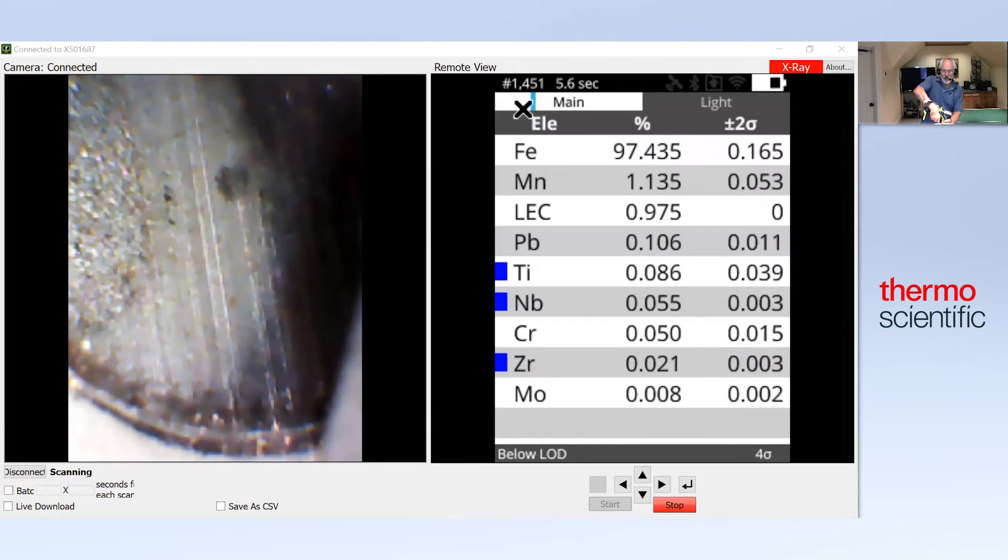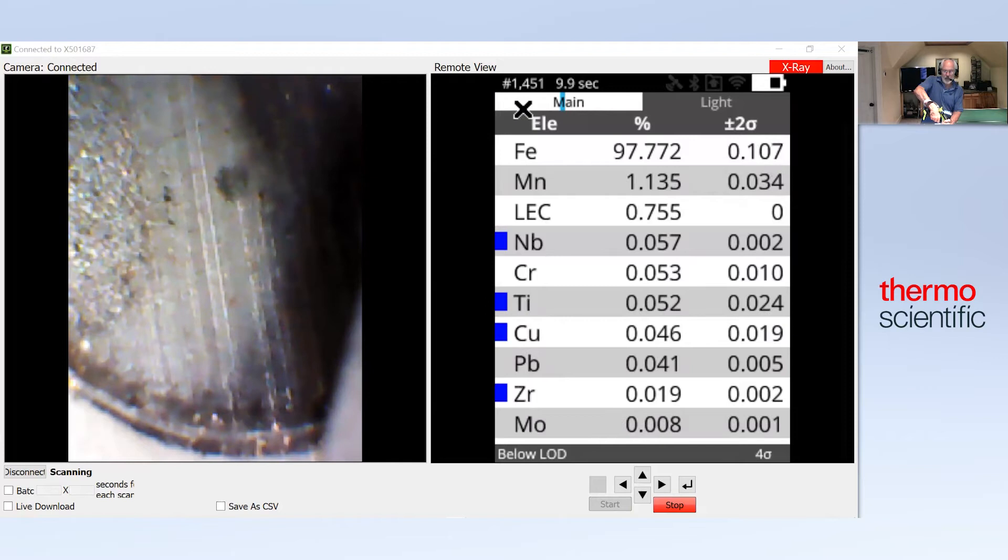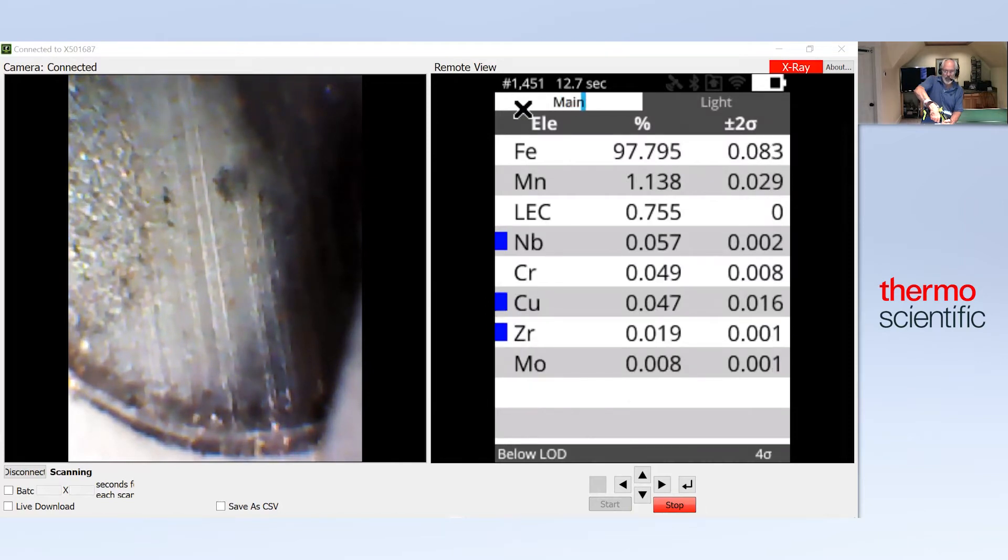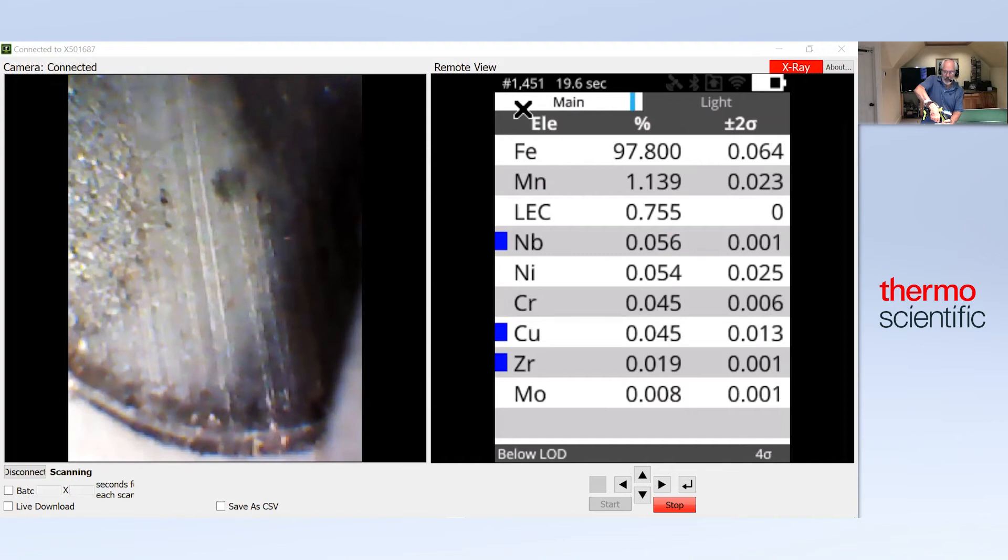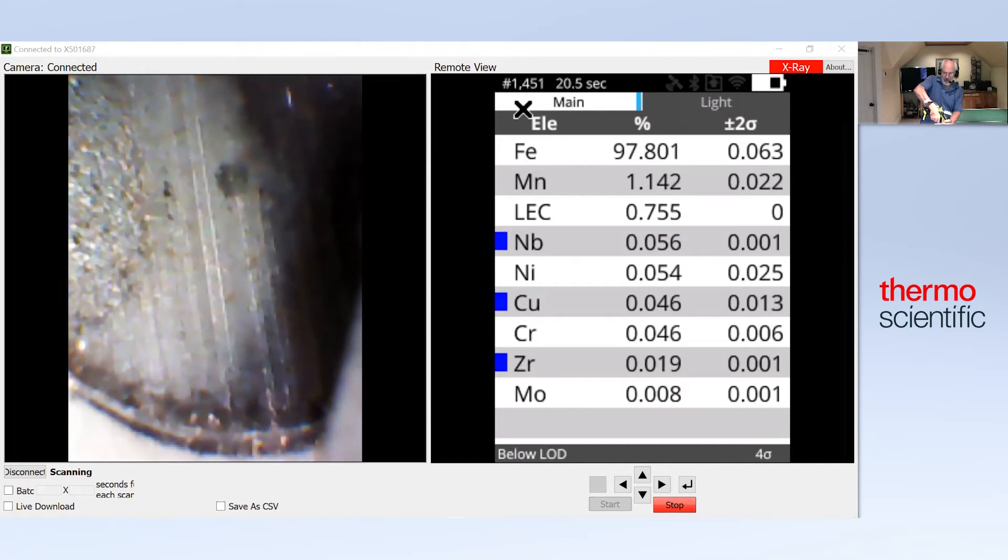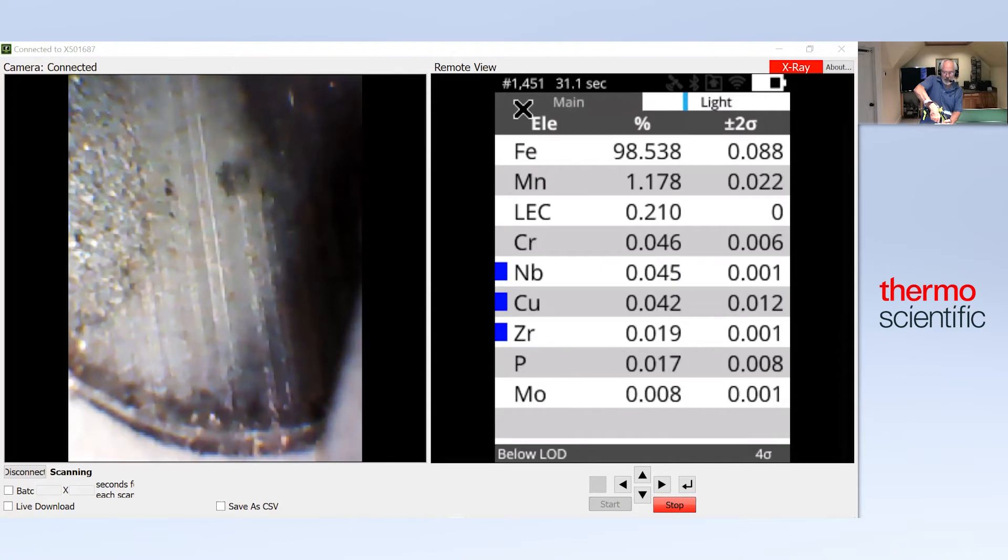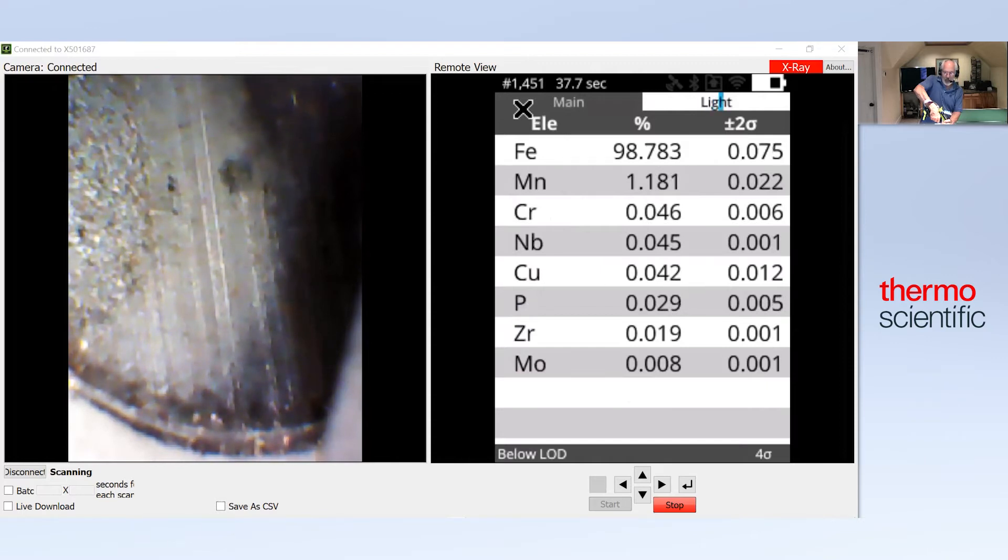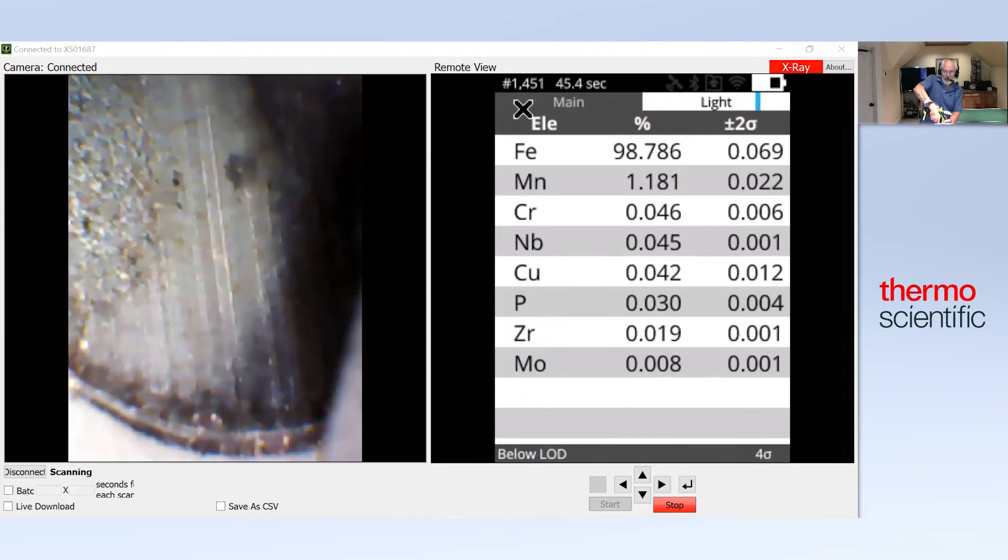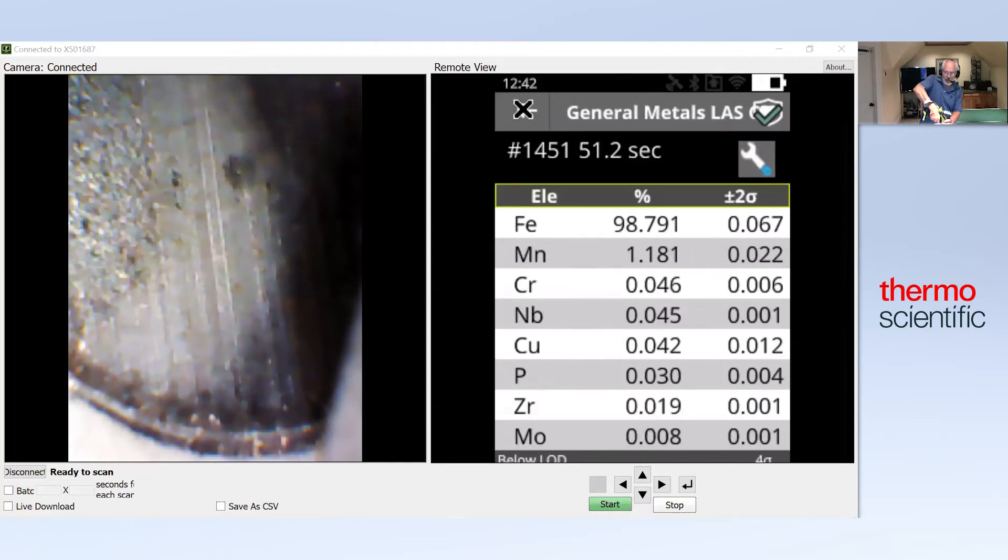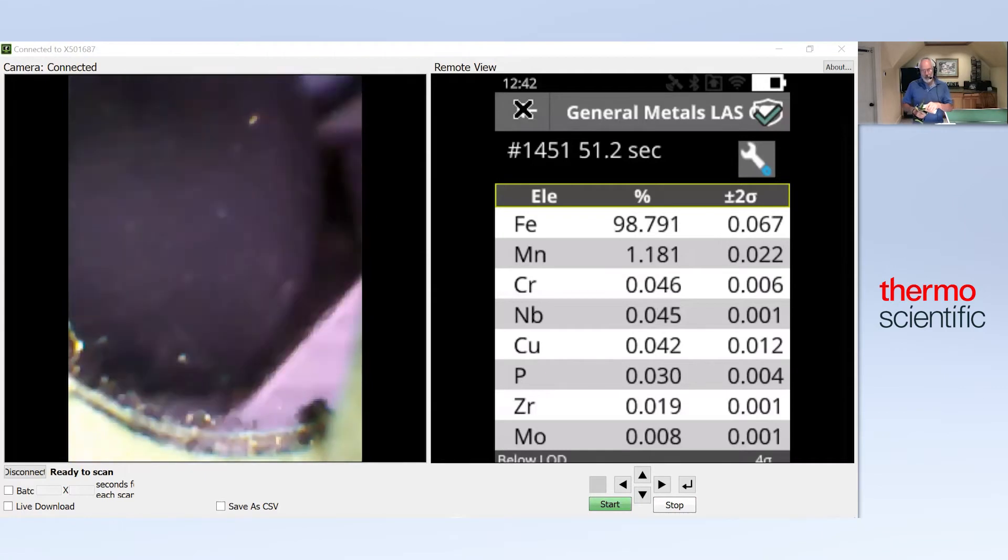The main filter is the one that measures the heavy elements, such as the ones you're seeing on the screen now with the exception of what's called LEC. LEC is light element content. That's the elements that we have to measure with the light filter, elements like aluminum, silicon, sulfur, phosphorus in the case of iron-based materials, or even magnesium in the case of aluminum alloys. The key with XRF is if you're looking for light elements and very small quantities, you measure a little longer because the longer you measure, the better the precision and therefore the better the accuracy.